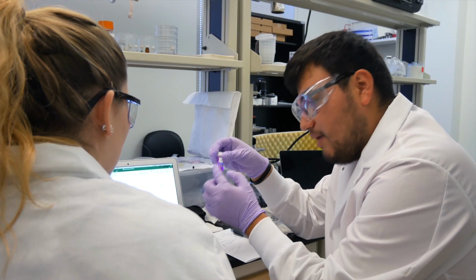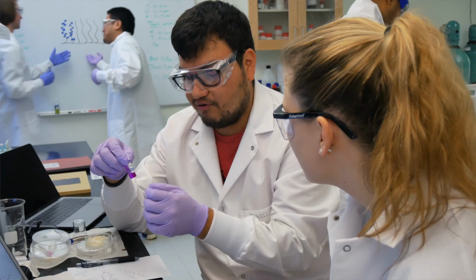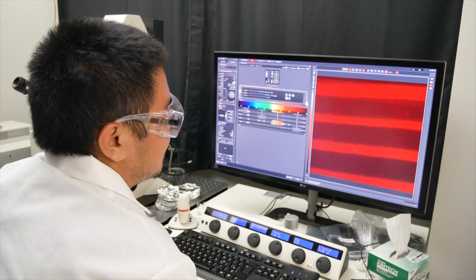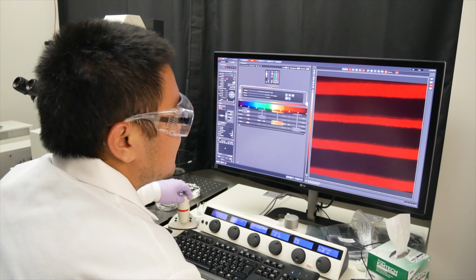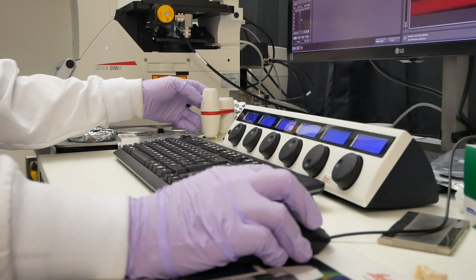Students in our lab are really working on a lot of relevant polymeric materials. So they use things like high-speed microscopy. We process these images at the same time when we're measuring mechanical properties. This is something that is a little bit difficult to get in other labs because the tools are not quite there. But we have the tools to show students how to do imaging in situ. We look at microscopic engineering, which is something that the field is moving towards.